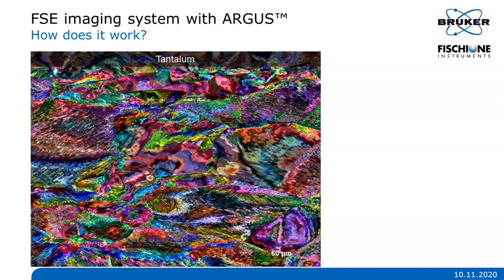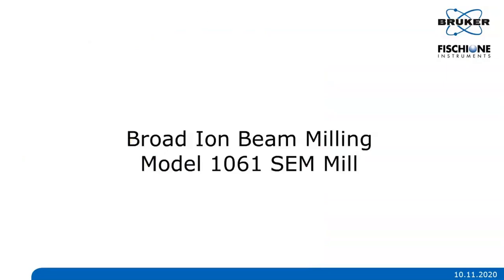And it provides the orientation contrast images with highest resolution, ideal for your presentation or to qualitatively investigate plastic strain and residual stress. But for this, sample preparation is the key, since the subsurface must be free from deformation induced by the preparation. And now we will see with Pavel how the EBSD sample preparation can be optimized.